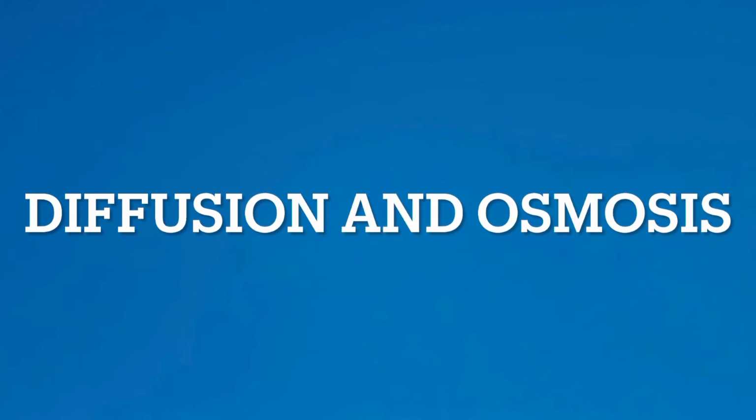In this video, we will be explaining diffusion and osmosis through experiments.